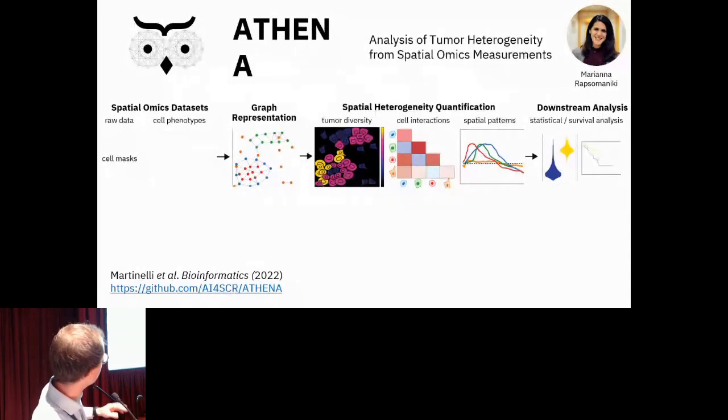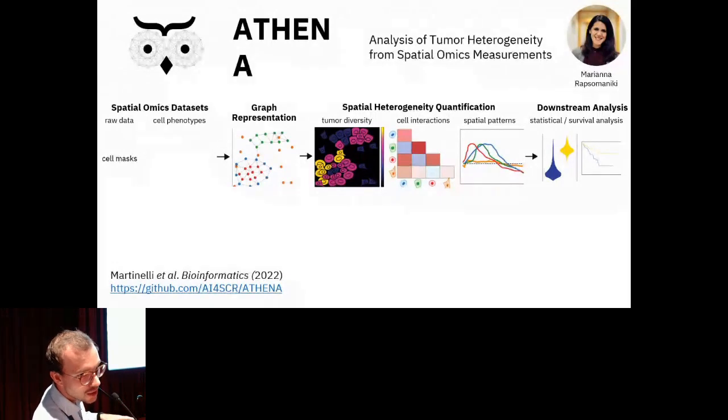Okay, we should see some raw data there. This would be the images that I just showed, and then some cell masks. The cell masks would be segmentations of those high-dimensional images. As we have seen before, these images just show the spatial distribution of the proteins, right? And what you actually want to have is the protein expression levels of each single cell.